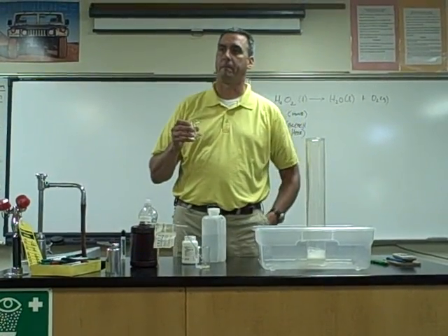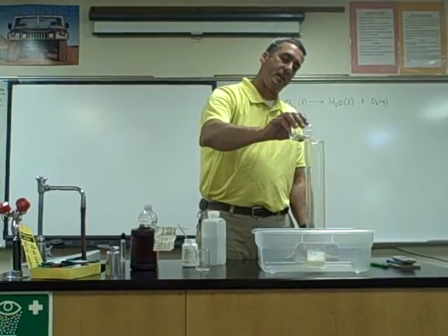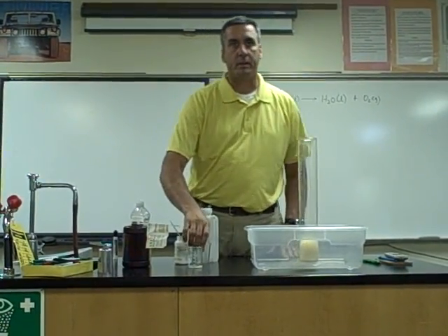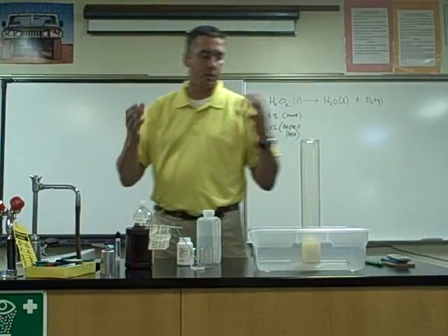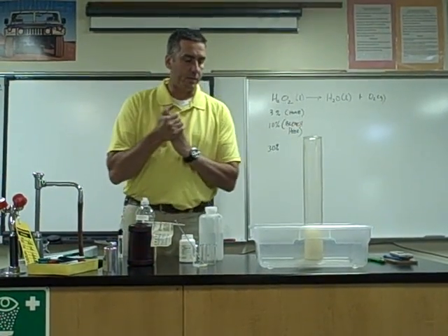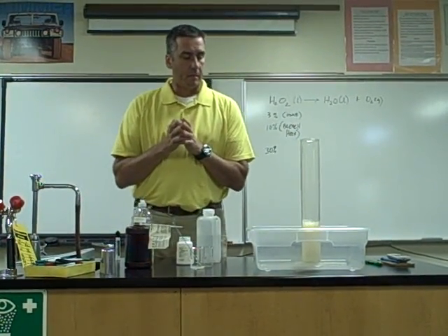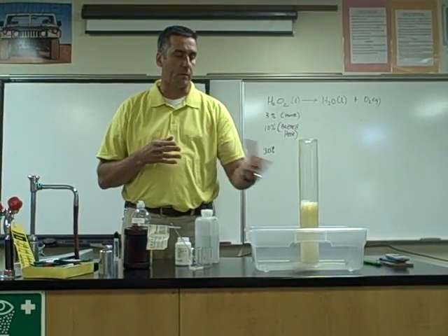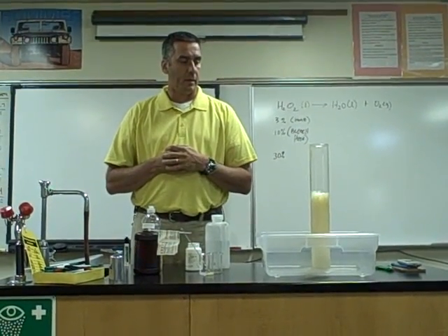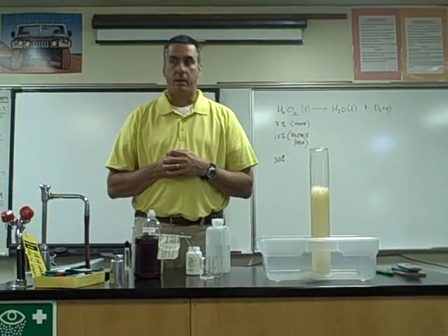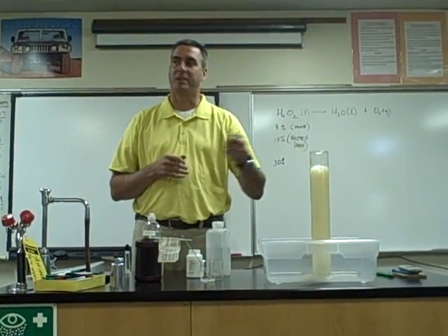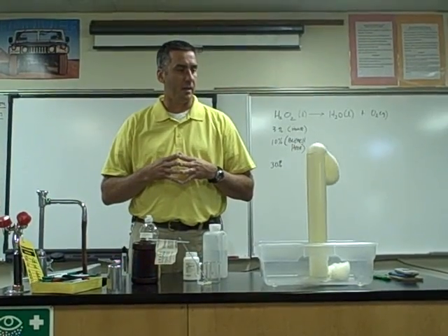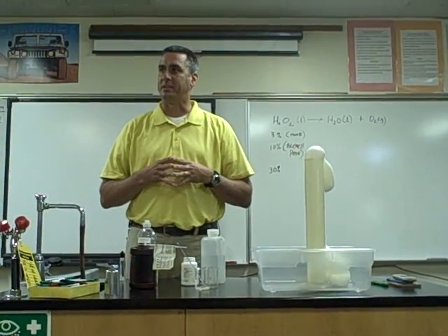We'll add the catalyst to our soap-peroxide mixture. There's a little bit of an induction period here, but after a few seconds you can see the soap is starting to foam. Of course, the bubbles are being filled with oxygen gas. It could actually take a match, but the gas wouldn't ignite — it would just help support combustion. It speeds it up considerably, doesn't it?